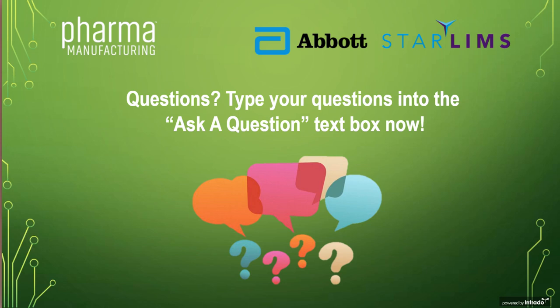Okay, great. I have another question here that looks like it's sort of about compatibility. This attendee is asking, to incorporate LIMS into the larger data management system architecture, LIMS needs to be able to communicate with other data collection systems like historians. Is data in LIMS able to be retrieved via OPC or SQL queries?